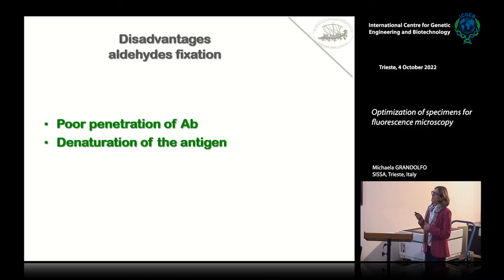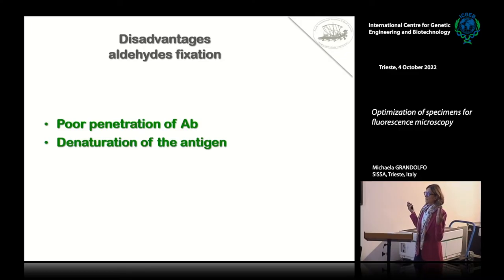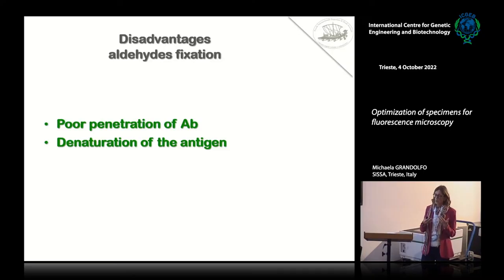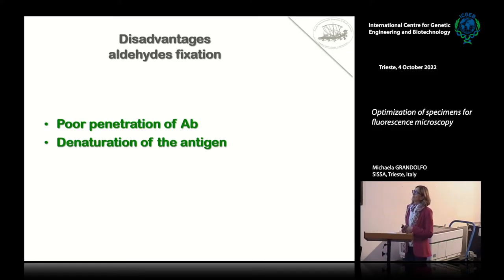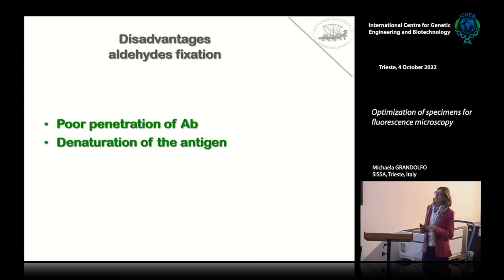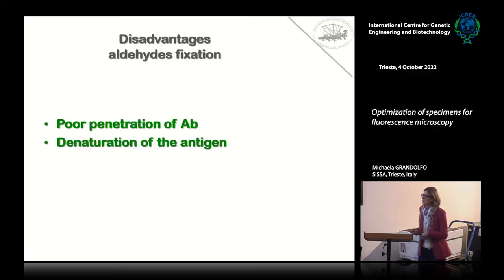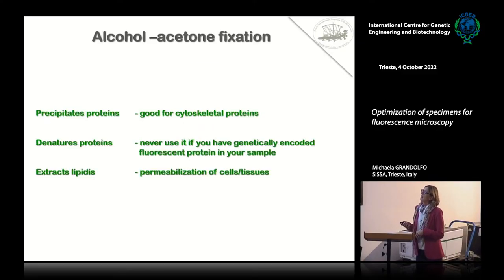The disadvantages of aldehyde fixation: very often you have poor penetration of antibody due to the cross-linking, so you have to think of an antigen unmasking step. You can also have denaturation of the antigen, also due to the formation of cross-linkings.